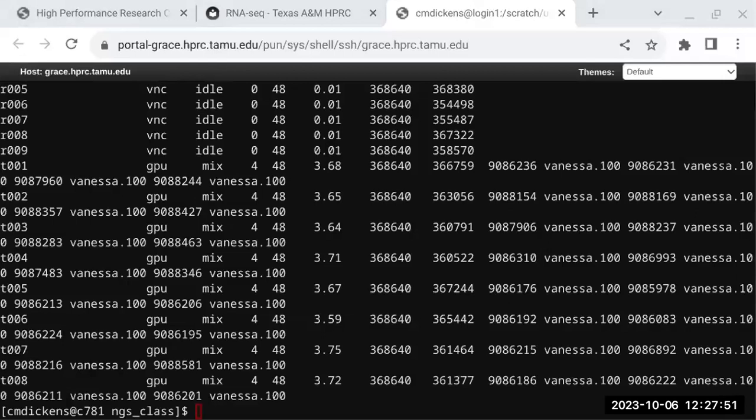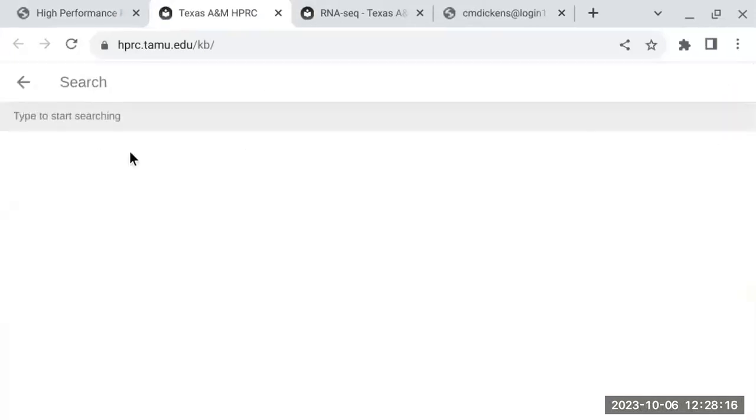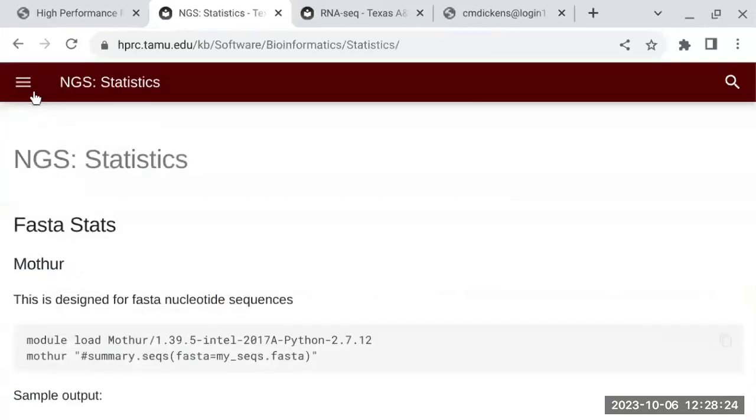All right, that's it. We have a lot of resources online. Like I said, our documentation is built off several years of experience from our end and from our users. Check our documentation out. Search for whatever you need when you go to our documentation. There's a search feature up here. Trinity. Okay, that way you don't have to browse through the menus like that. Use that search feature.